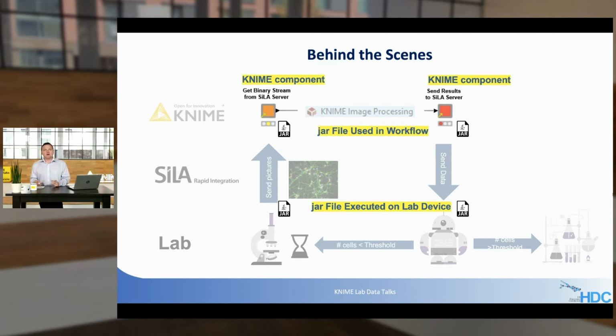So how it is done: the jar file gets called, and gets the request to send the data. The jar file in the Knime component hands over this data. The Knime component unpacks it, and the same jar file takes care of sending the result back to the robot.